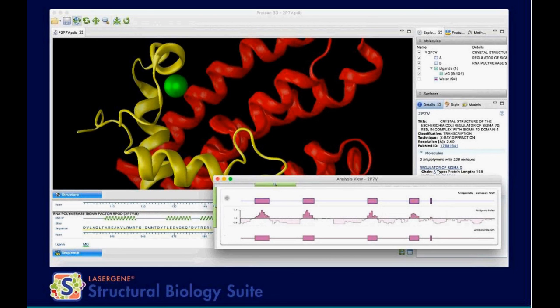So with this application, right now you're seeing a lot of the multi-window views, but it also has the ability to be a singular view, which you can tailor to your own preference. And this is the place to go to view your NovaFold results.